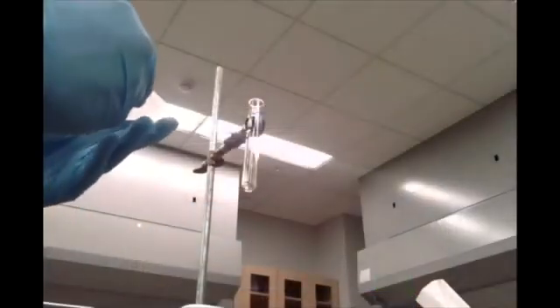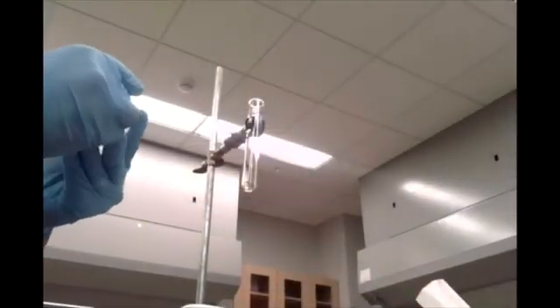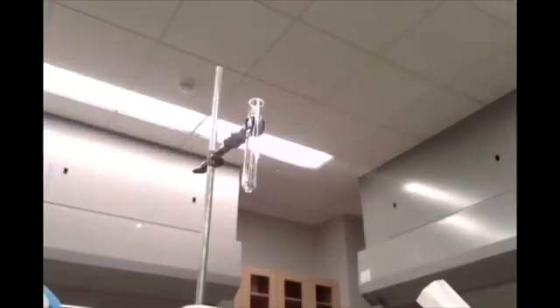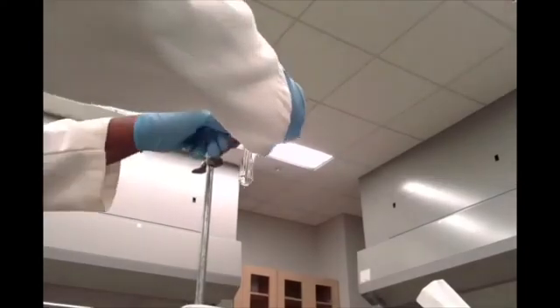Now we'll add our potassium nitrate very carefully to this test tube. It might be easier if I hold this in my hand while I do that. There we go.